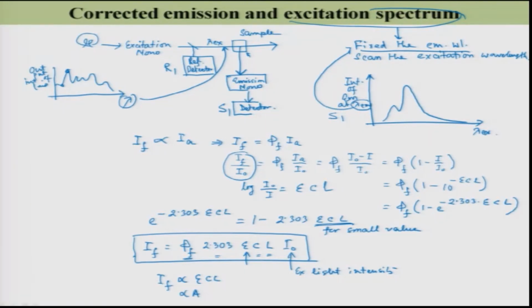What you are going to plot is I f. This excitation spectrum is proportional to A. So, the excitation spectrum is the same as the absorption spectrum.